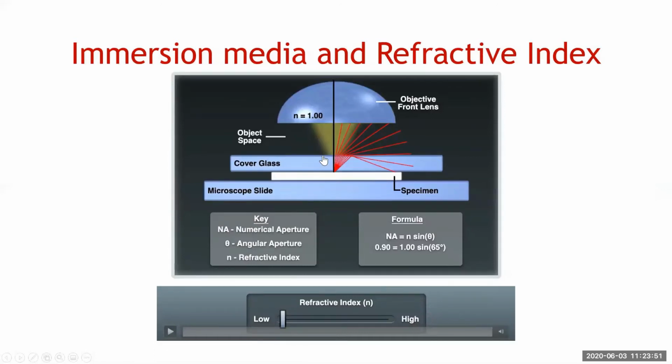So I'm going to start the video now. Just keep an eye on the rays of light and of course the cone of acceptance there. You can also start to see the little edges here of what should be an immersion media. Around about back there, that would have been water at 1.33, and now it's probably oil of some description.